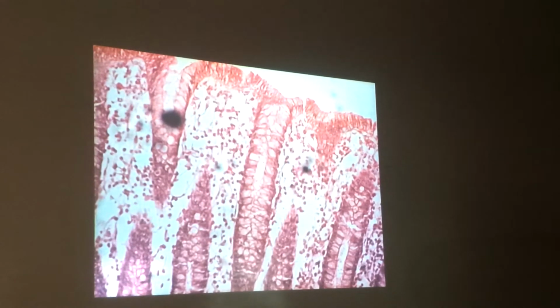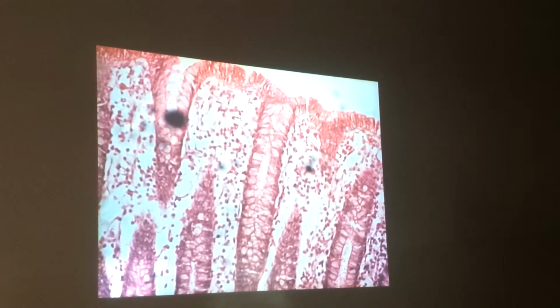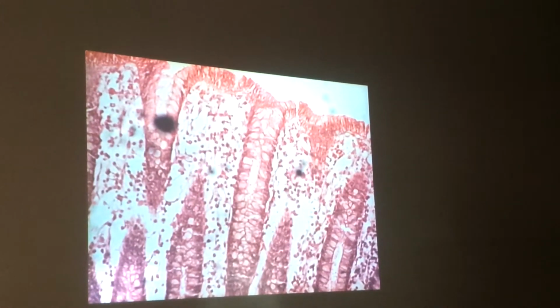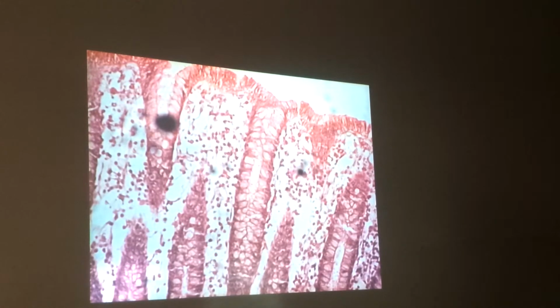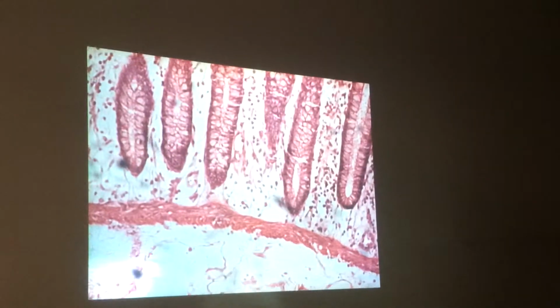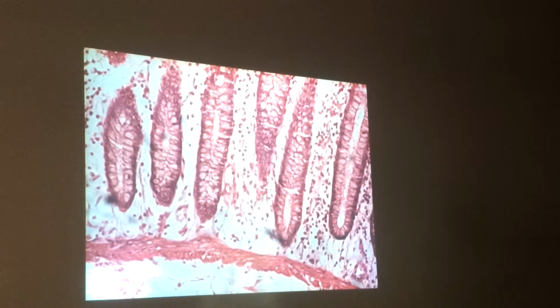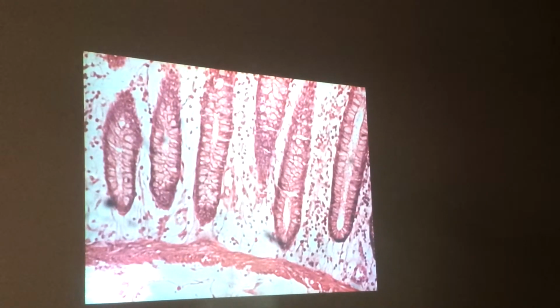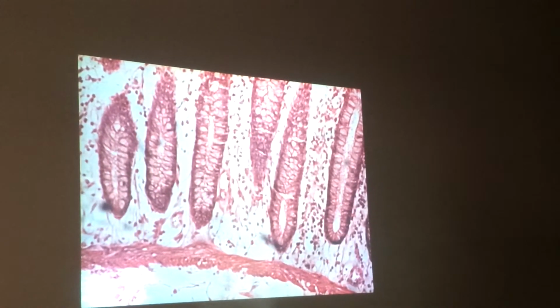The lamina propria is always this stuff in here. Again, doesn't look like anything. Lamina propria there. These are intestinal glands here. Now, here's something that, if it's on this slide, I hope it is. There, and it is very good. That's muscularis mucosa. That will be a question.